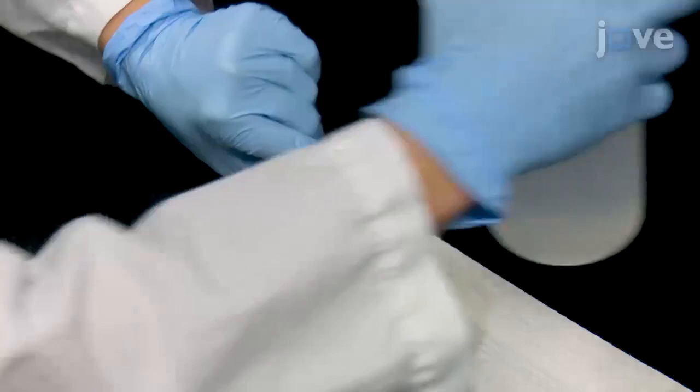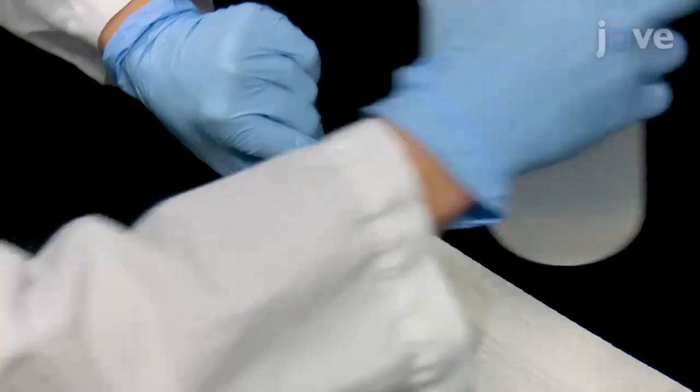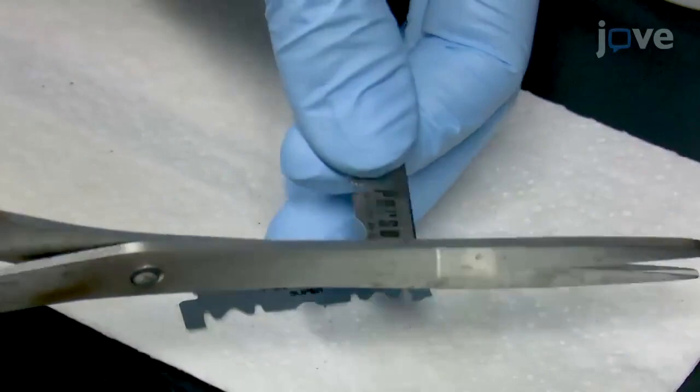Now, prepare the blades. First, clean a double-edged razor with ethanol and allow it to air dry. Then use scissors to cut it into approximately one centimeter pieces.